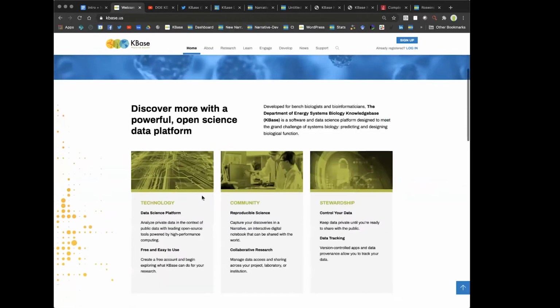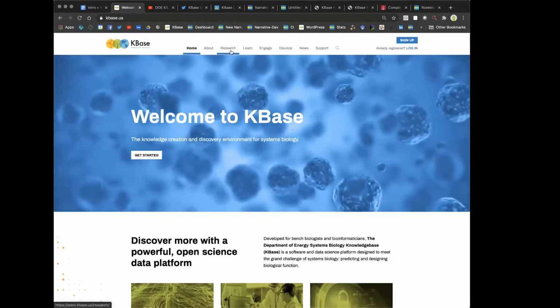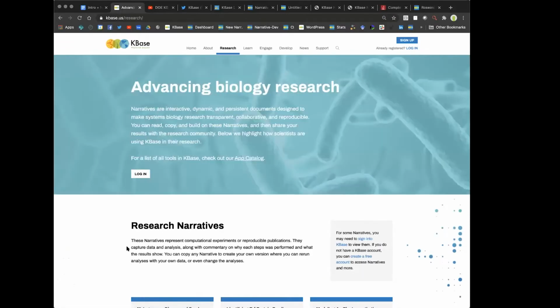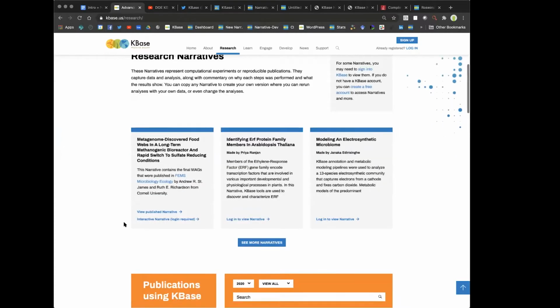On the homepage, you'll of course see some basic information about the system. The research page is a really helpful place to see what people do in KBase and what the various participants in the KBase community are up to. We post things like narratives or publications that we want to highlight here.